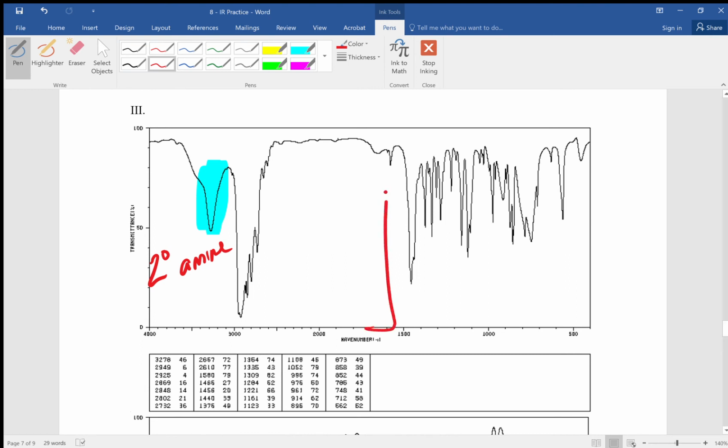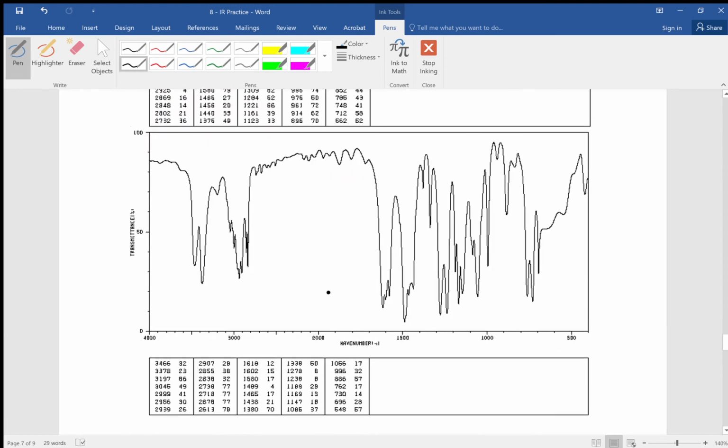We can also rule out anything that has a carbonyl in it. So we're looking for the one and only option on this list that has a secondary amine. Which is that compound. Now this is a direct contrast to the next spectrum, which clearly gives us our primary amine pattern. So in the primary amine, we're looking for an NH2 group, and again, there's only one option that contains that.